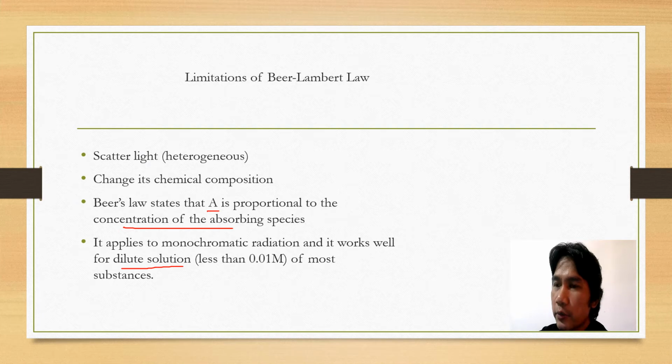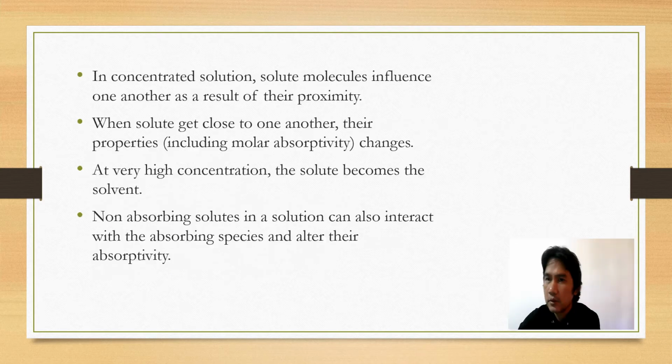If you are going to prepare a solution, preferably it's less than 0.01 molar. We don't prepare a very concentrated solution.